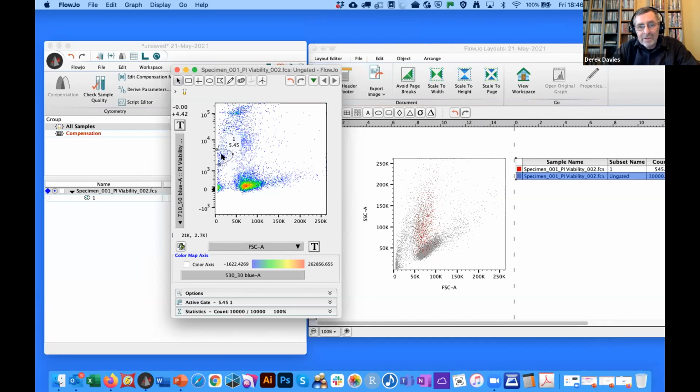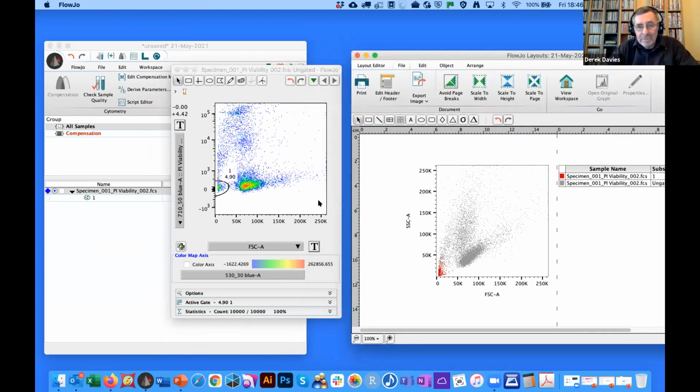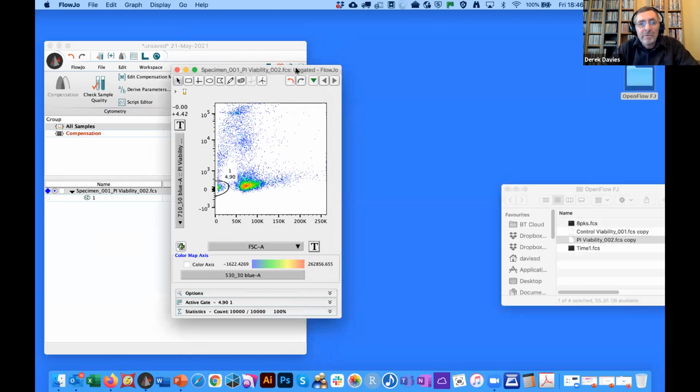What about these here? These have low propidium iodide signal, but also low scatter, and they appear in this sort of area. So as cells are dying, they're probably starting to break up, getting some debris, maybe with a little bit of DNA attached, possibly apoptotic bodies. And then if I go down to here, this stuff in the corner, that's my debris down there. So by exploring my data like that, I can get a better understanding of both the way these plots are displaying the data and also the biology behind it. Remove that for a moment.